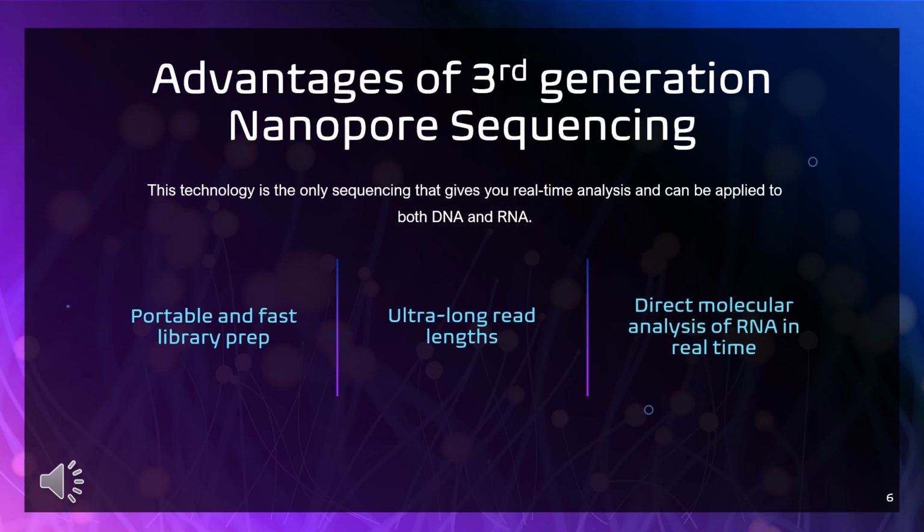There are a lot of advantages to nanopore sequencing over other methods, but I'll just cover a few of them here. Illumina, which again we've discussed mostly in class, is short read, and this has to be done in a lab environment to achieve high throughput. PacBio is another long read technology like Nanopore. However, PacBio and the other long reads need to convert mRNA into cDNA, whereas Nanopore can directly sequence native DNA or RNA. The MinION device is handheld and portable, as well as USB rechargeable, which allows for real-time reads when you just really need to know what kind of RNA you have.